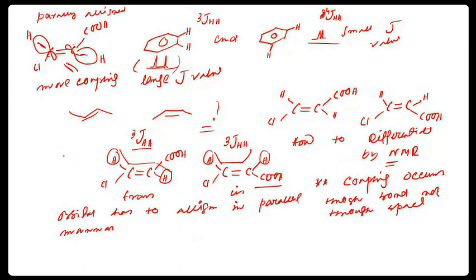And look here, the orbital for the cis one. So this is C double bond C, H, H. Just draw the orbitals. Just I put it here, also covering the hydrogen. But here it is not parallelly aligned.